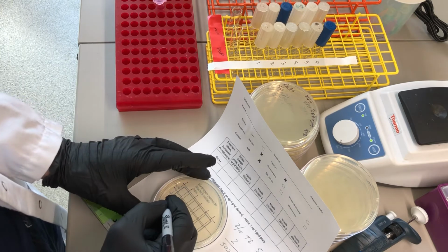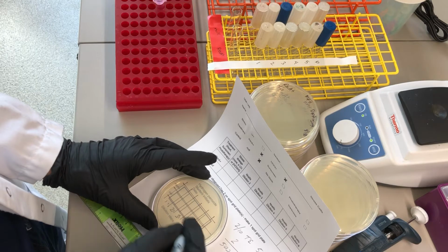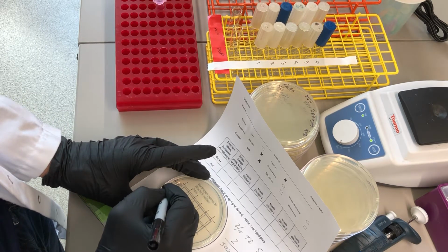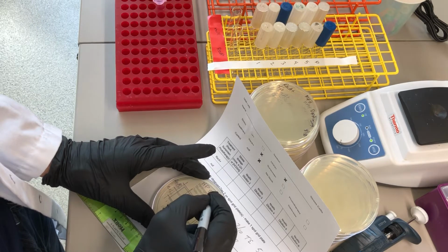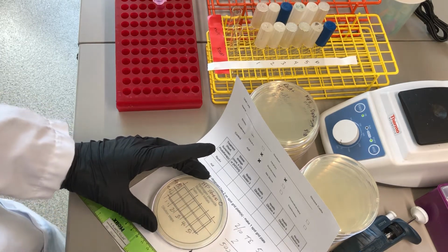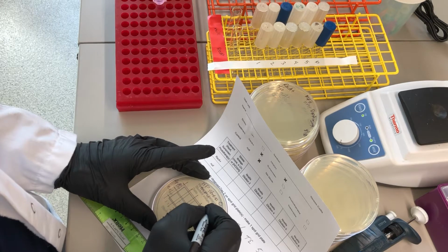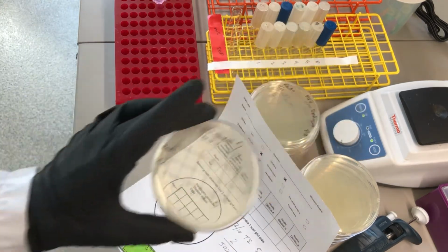Here's my dilution steps. 1, 2, 3, 4, 5. Rec A positive. And then hydrogen peroxide stress. My stress level happens to be 0. No stress at all. My initials or your full name, today's date. So that's ready to go.